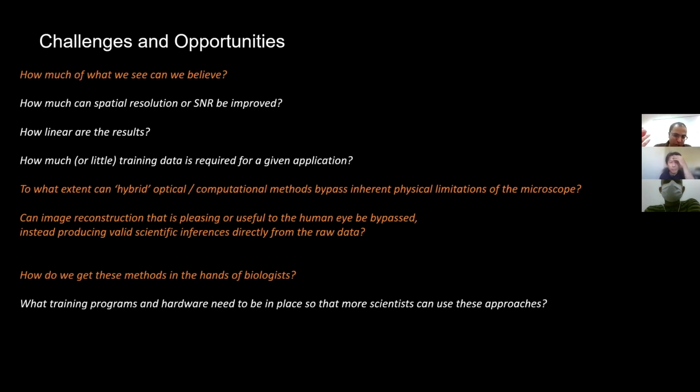As an instrument developer, I'm really interested in these hybrid workflows, where you build better microscopes and you utilize neural networks to inject more into the image. And of course, maybe this is science fiction, but at the end of the day, the biologist doesn't actually care about the image. This is the hard truth of our field. They want something in the image, whether it's a segmentation or a fluctuating calcium signal.